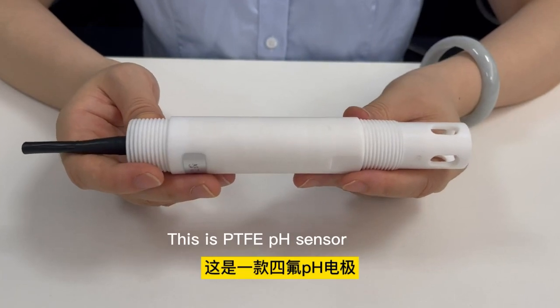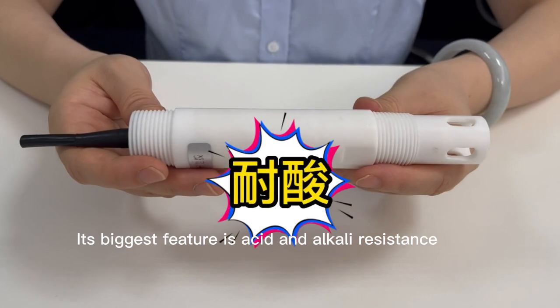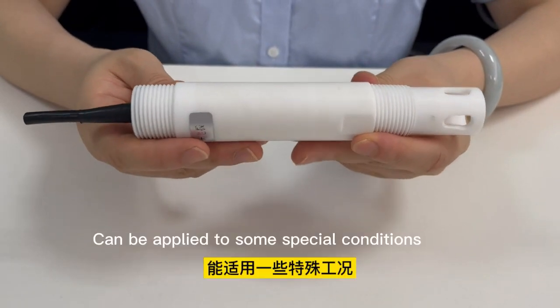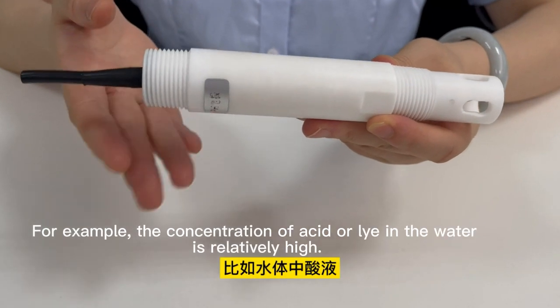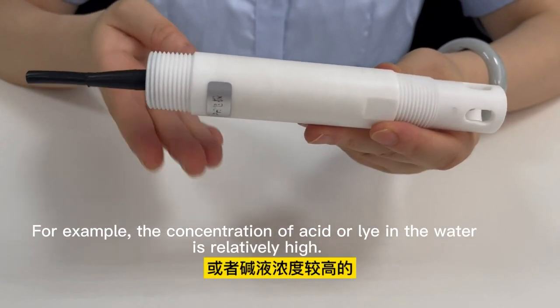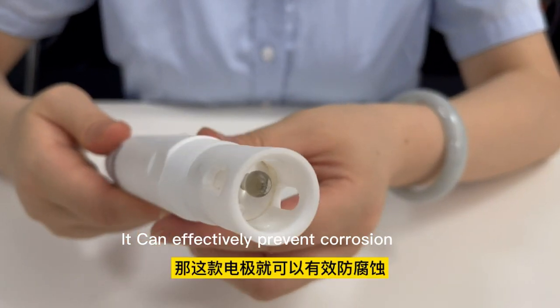This is PTFE pH sensor. Its biggest feature is acid and alkaline resistance. It can be applied to some special conditions, for example where the concentration of acid or alkali in the water is relatively high. It can effectively prevent corrosion.